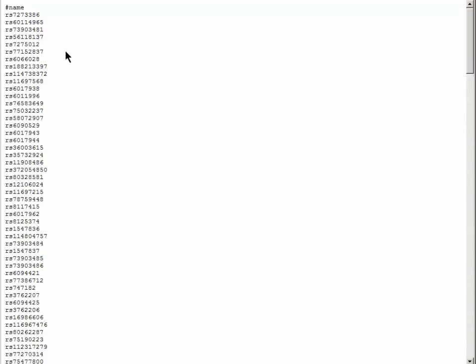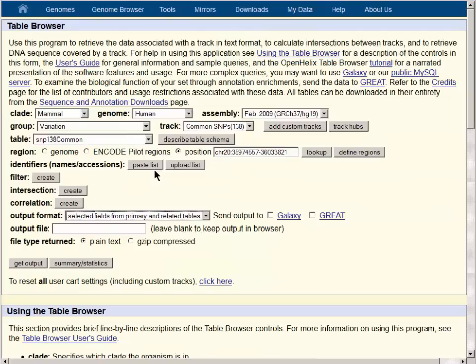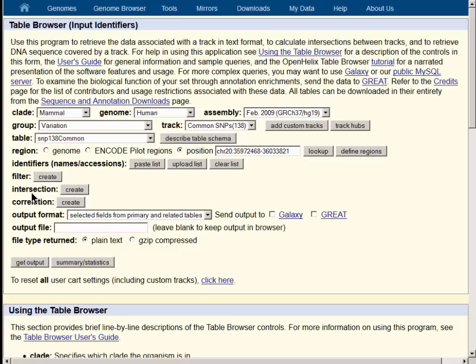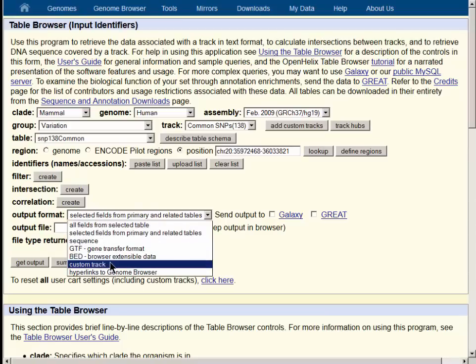To demonstrate that we have the list we really want, let's choose just the RS numbers from the list. We'll leave the header behind, and we will copy this list back into the table browser and use it to generate a custom track, so we can visualize our SNPs on the genome browser. The Back button takes us back, and we will use the pull-down menu to go to the main page of the table browser. Using the Paste List button, we go to the page where we can load our SNPs into the table browser. The Submit button loads the list of SNPs, and then the Output Format button lets us choose Custom Track for our output.